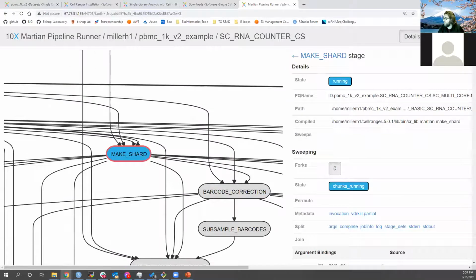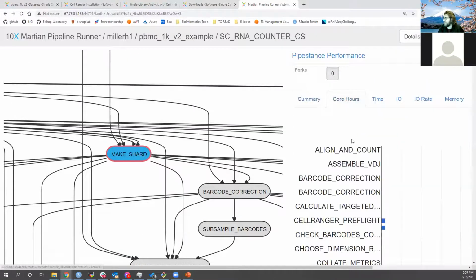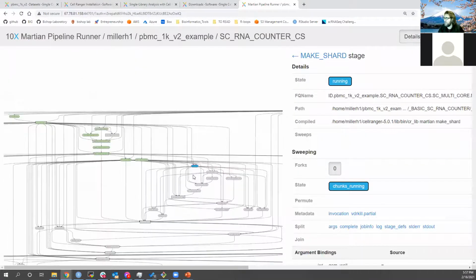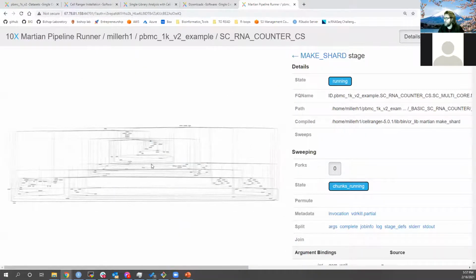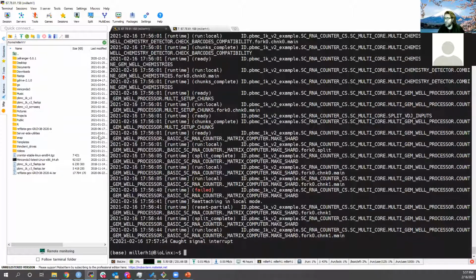And you can even see how many resources your pipeline is using by command. There's a whole lot you can do here. It's not really super important that you understand all this. It's just really nice, if you get to the point where you're trying to actually run this yourself, to know how to navigate this. But since I've already run this pipeline, I'm just going to kill it. And we can now go to the output, which I generated earlier today.